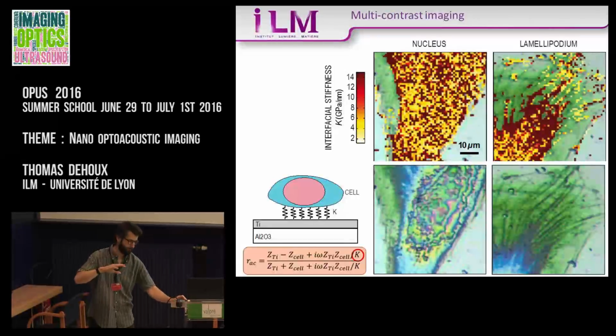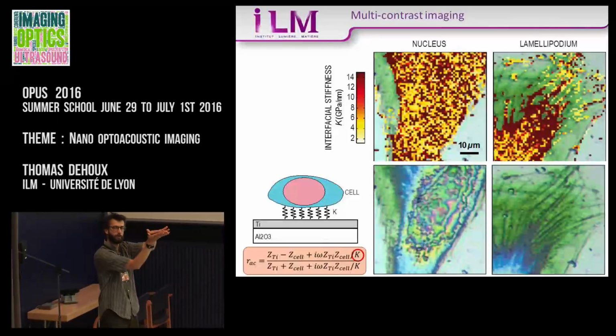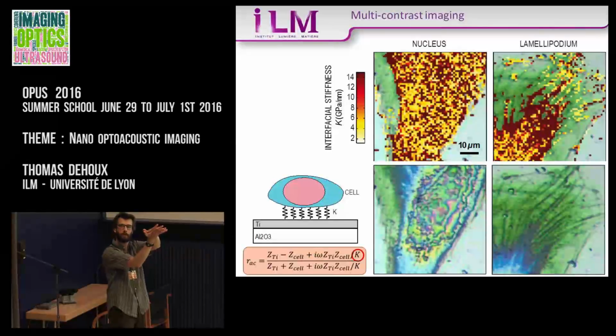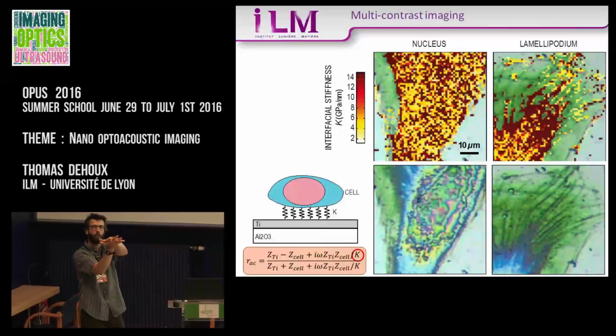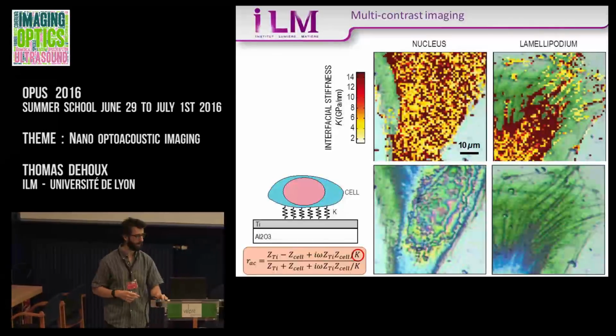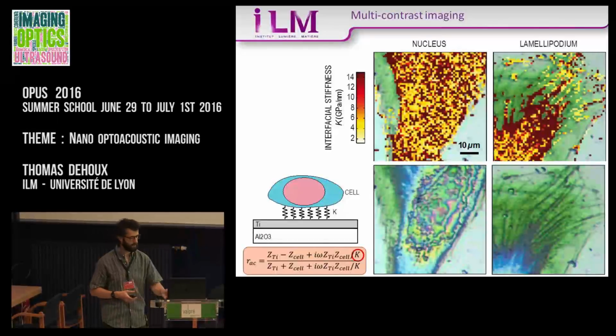And on the edge, the cell is sensing the mechanical properties of the environment, so the very tips of the fibers are moving and pressing softly on the surface just to probe the mechanical property of the environment. That's why we have a lower quality of adhesion at the edge.